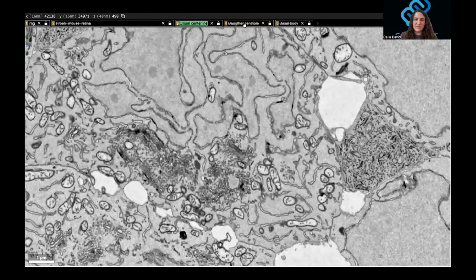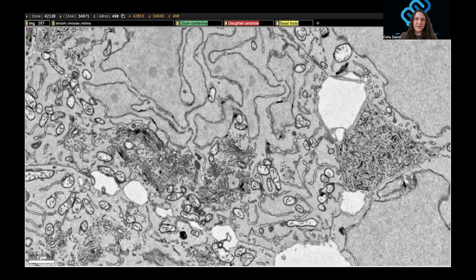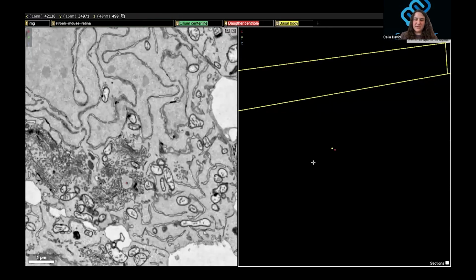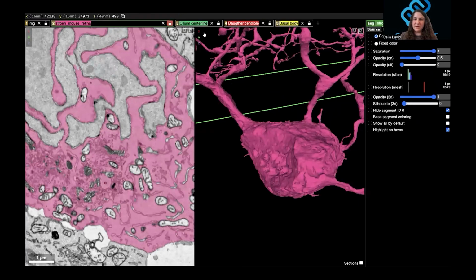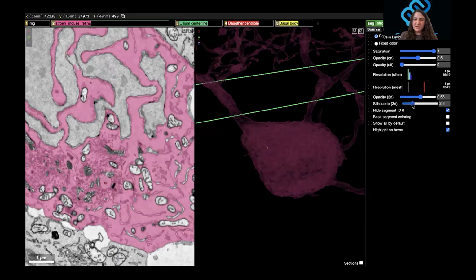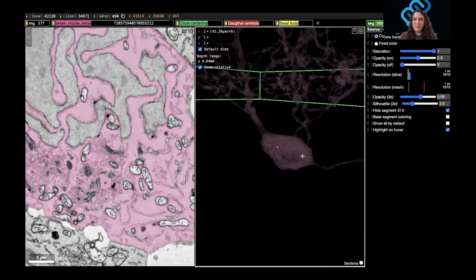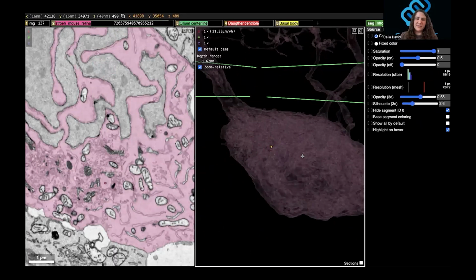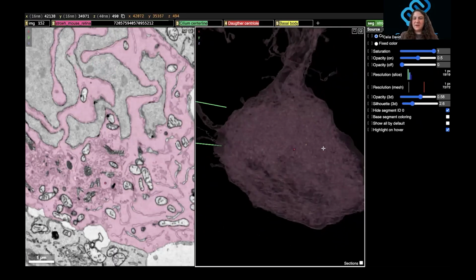Okay, and then I think that these were labeled already. So there's the daughter and the basal body. I'll go back to the 2D layout and the cell, and I'm going to turn down the opacity on that again. So you can see on this one, this is how you'll label one of these ones where it's just an internal centriole pair.